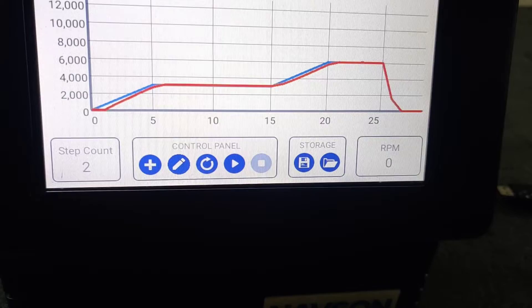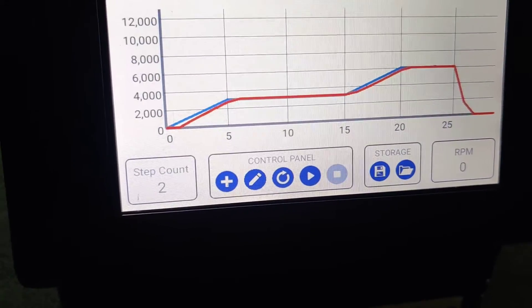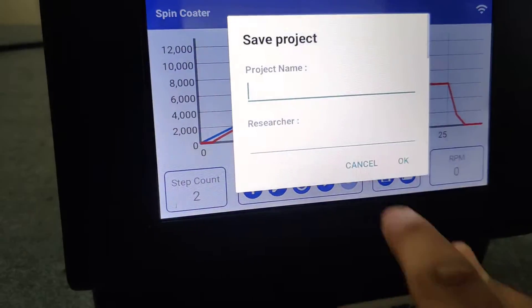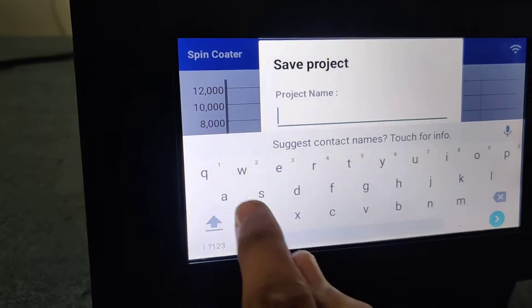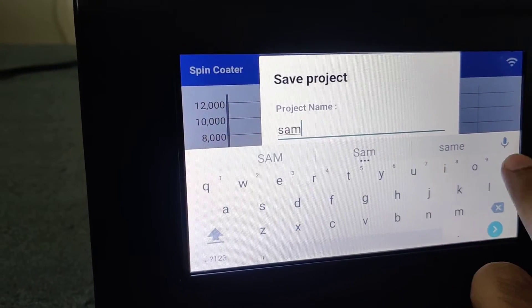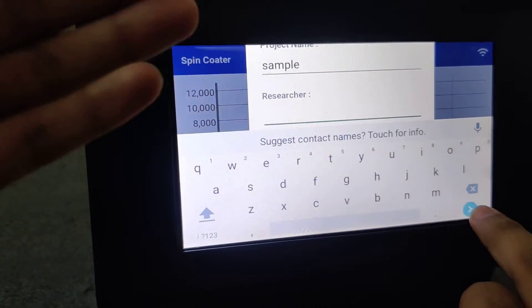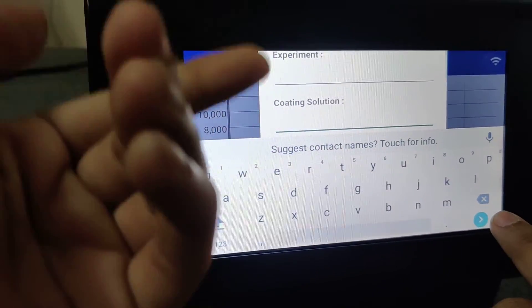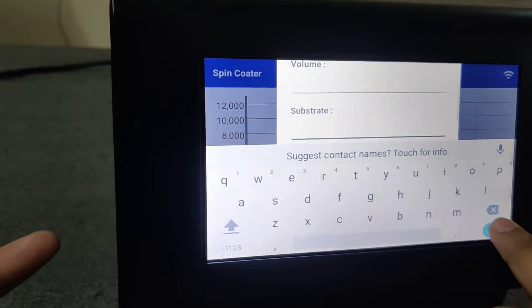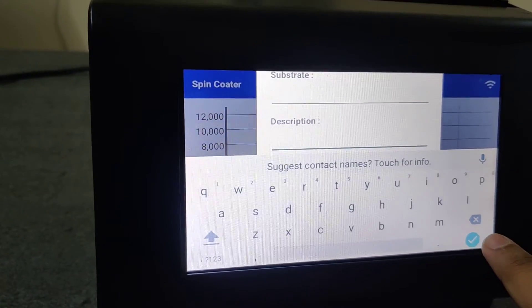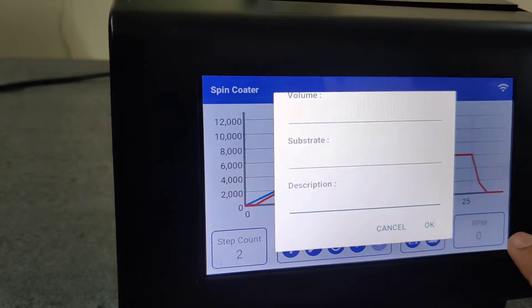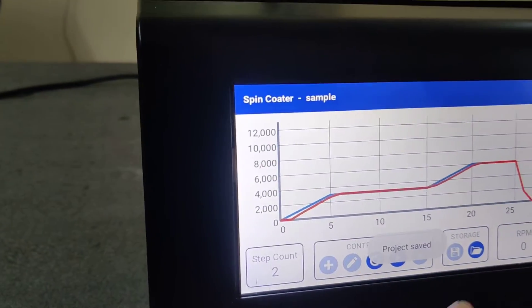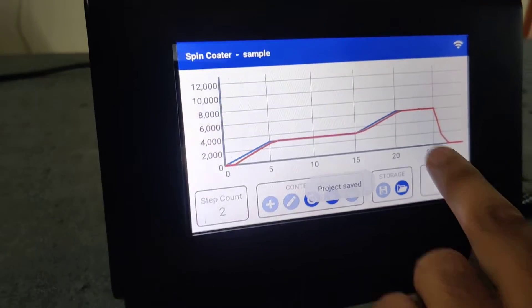So once it is done, if you want to save the program, you save it. Say you will save example. So it asks for the researcher's name, experiment, what coating solution you are using, what volume you are using, what substrate you are using, description if you have any particular thing you need to write up, and these are optional. So whatever is useful for you, you use it.